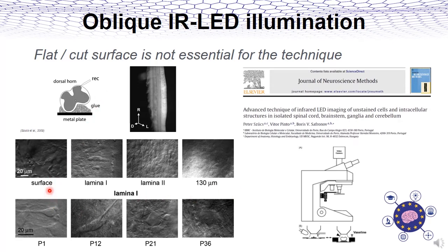The condenser of our Axioscope microscope was removed completely, and different chambers have been designed to accommodate the different preparations that we've tried.